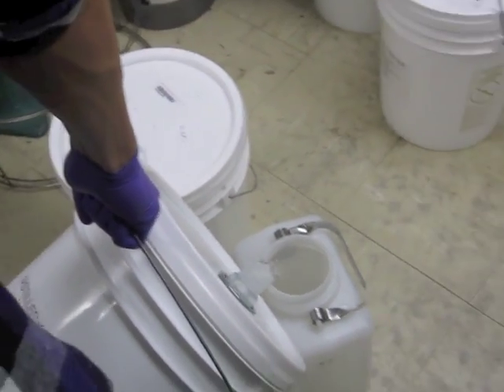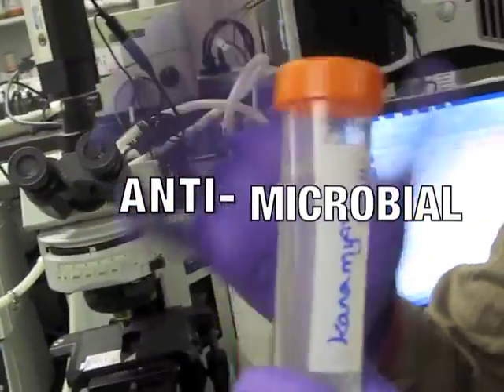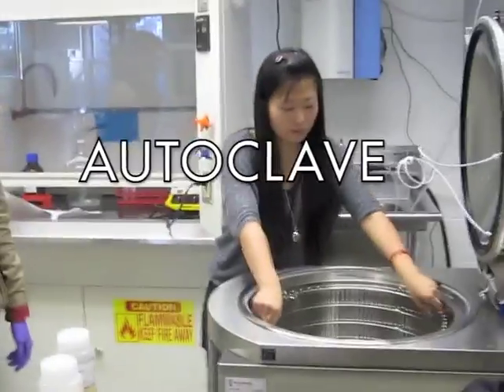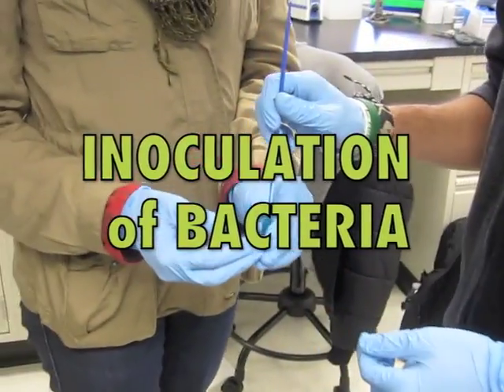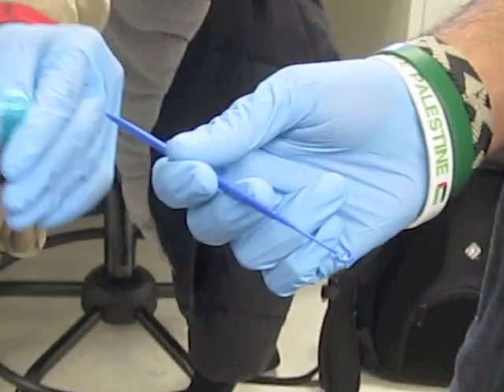We started the experiment by preparing agar, LB broth, and antimicrobial kanamycin solution. We autoclaved everything, allowed the solutions to cool, and poured the agar into plates before inoculating them with bacteria and placing them in a heated chamber to grow.